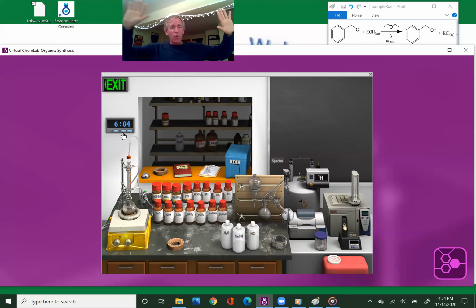Woohoo! It's 6:04. Not really, but it is on Beyond Labs. It just went 30 minutes. My reaction has just completed 30 minutes of heating, and that's all the instructions said to use, that I should have produced my product in these 30 minutes.